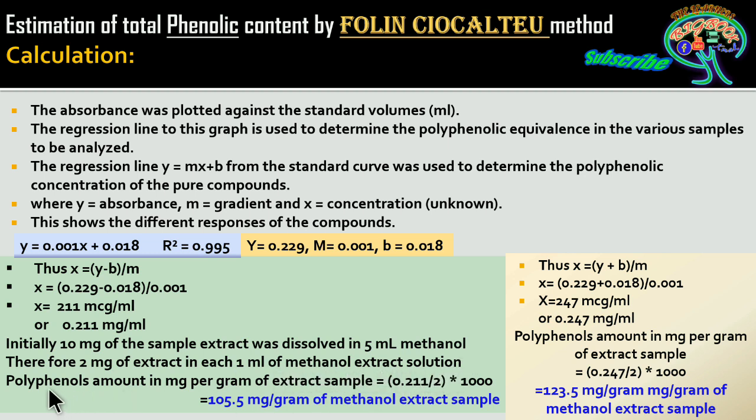So when you consider the polyphenol amount in milligrams per gram, here we do the calculation for the polyphenol in milligrams present in a gram.